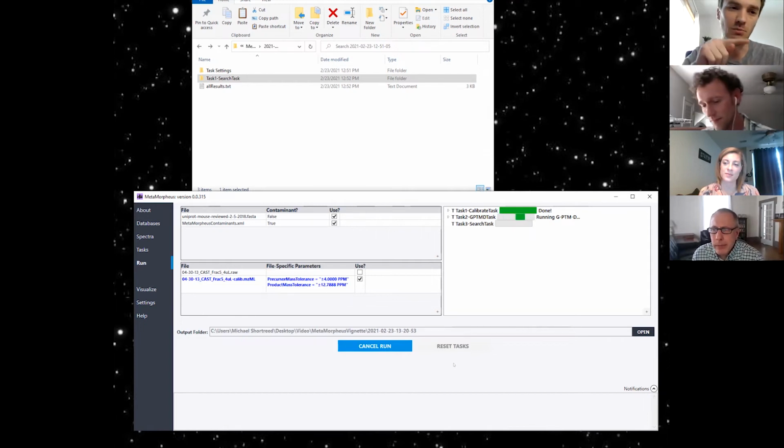And then you get a distribution of ppm errors that's kind of normal-ish. It's a little bit sharper than normal usually, but normal-ish. And so we calculate the interquartile range of that, which is the middle 50%, and then multiply that by 4. So it is a statistical measurement of how broad that distribution of ppm errors is.